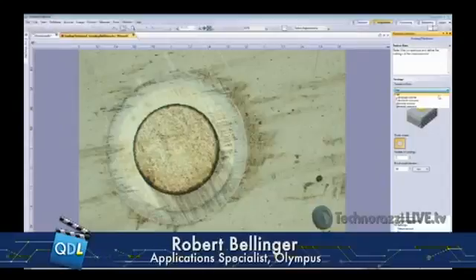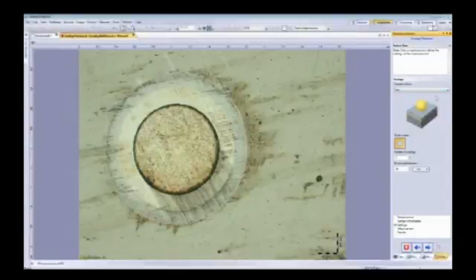For the settings, we can work on a flat image. We can also work on cylindrical or concaved. We just need to select what kind of material we did this work with. This one was a flat one. We type in the number of coatings, we type in the diameter of the grinding ball, and we just hit next.